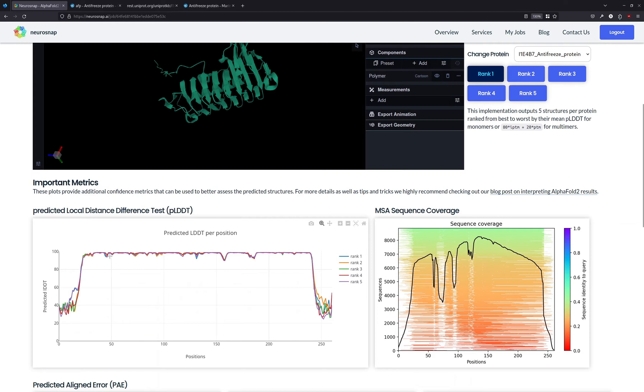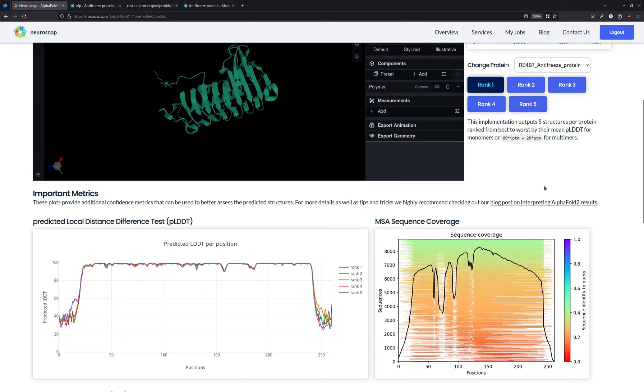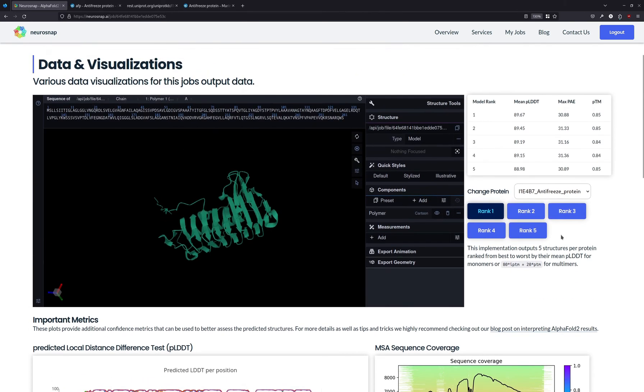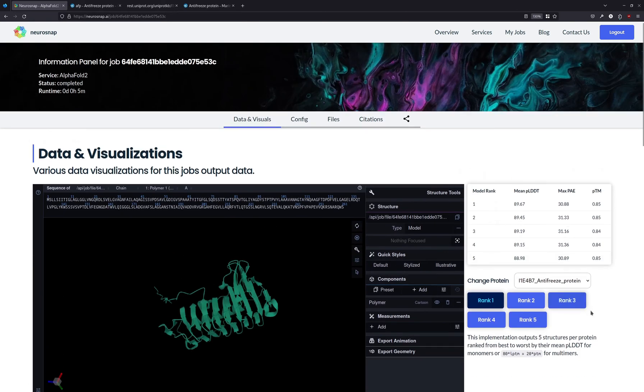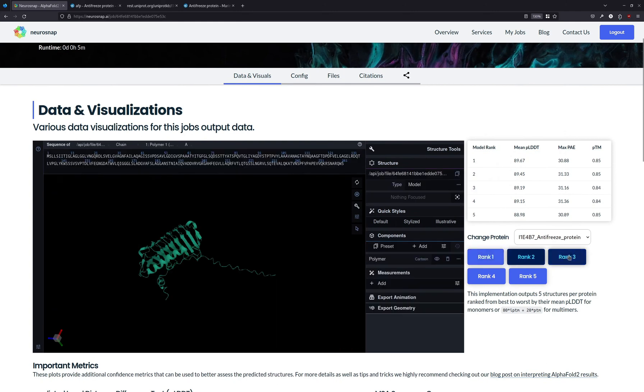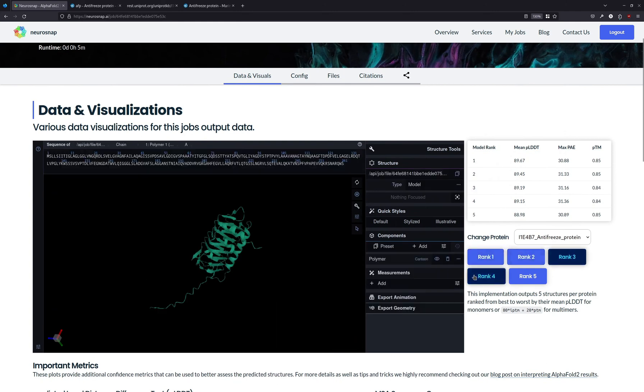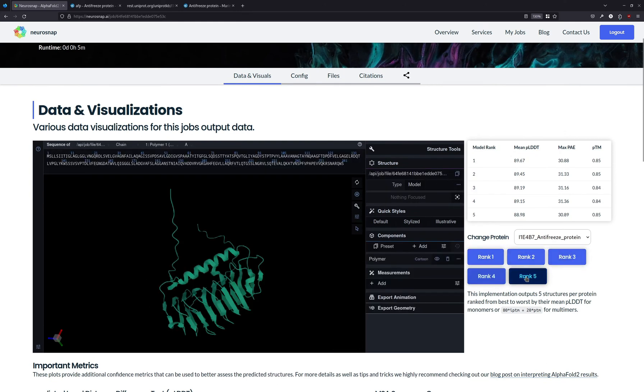Over here, we can see the average PLDDT for every single structure. So AlphaFold will predict 5 different ranks that are basically just different versions of AlphaFold trained on slightly different seeds. And these can be used to kind of distinguish whether or not a structure is actually high quality.